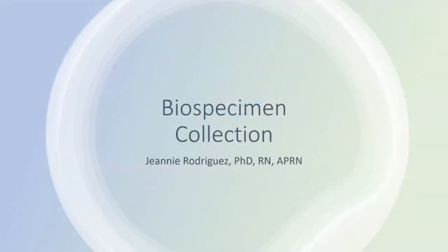In this video, we'll discuss some important information about biospecimen collection. So you've decided to maybe look at some sort of exposure in your research, or maybe some sort of metabolite that might be a downstream effect of an exposure, and you've decided on the type of specimen you need to obtain. Maybe it's urine, maybe it's saliva, maybe it's blood. So now you need to give some thought to how you're actually going to collect that specimen.